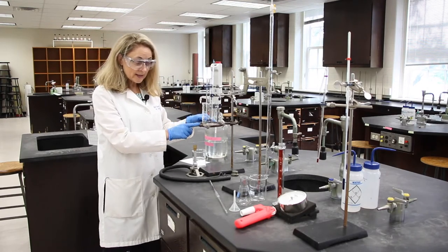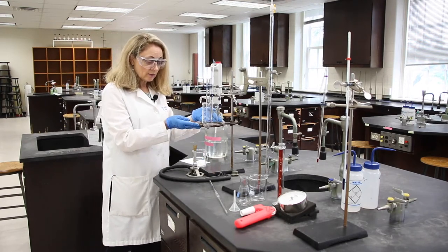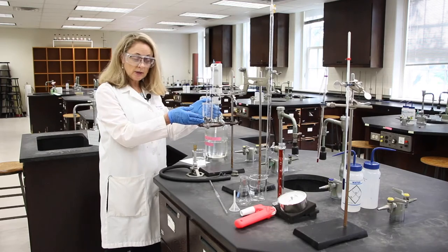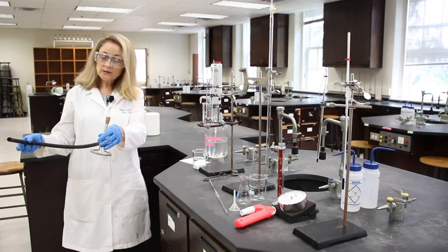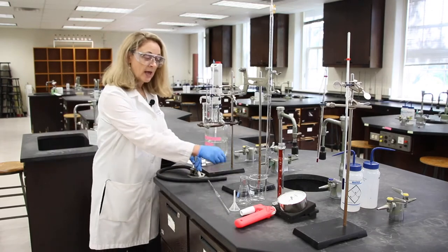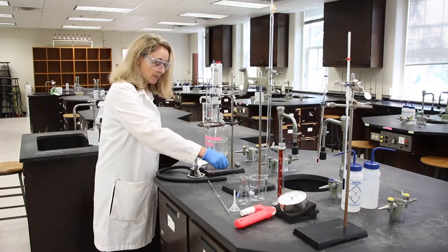We have a ring stand with a ring and gauze that we can set a beaker on, a Bunsen burner, and a striker to light our Bunsen burner.